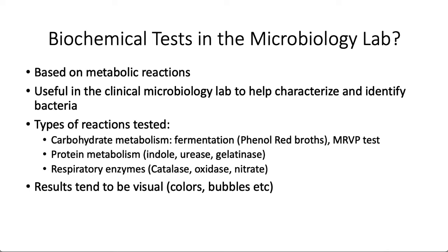So why do we use biochemical tests in the microbiology lab? They are very useful, especially in clinical microbiology, to characterize and identify bacteria. And in this particular lecture, if you were doing a microbiology lab in person, you would be mostly doing these reactions one by one.